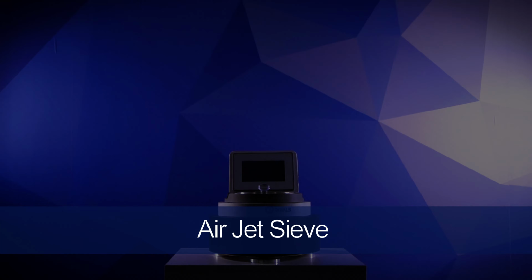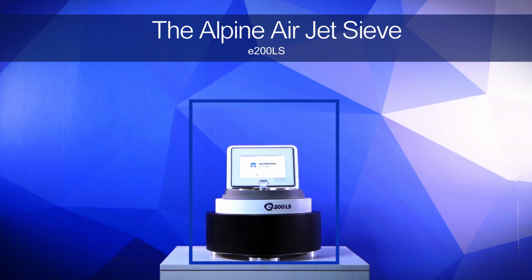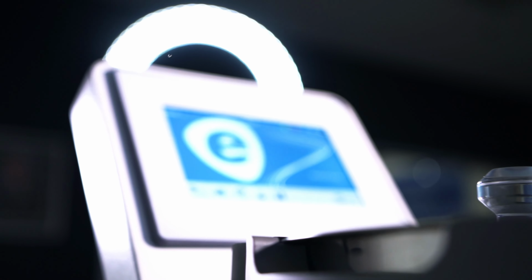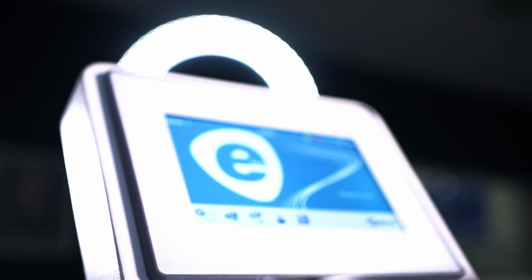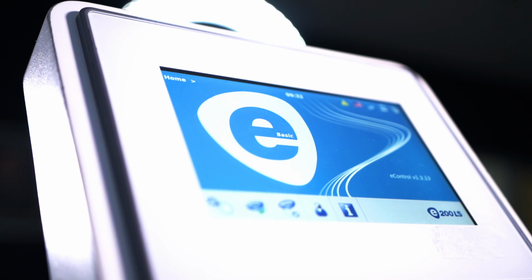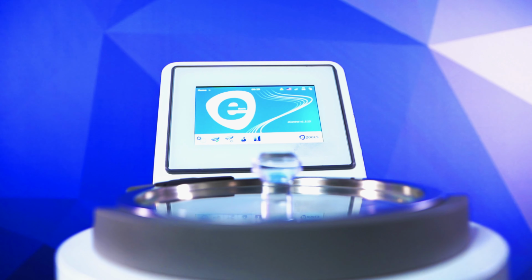Jet Sieves, like the Alpine Jet Sieve E200LS, is another particle analysis tool that has been gaining traction in the aggregate industry, specifically during the production of cement mixtures. In fact, the Alpine unit has been written into several cement-related standards in recent years. This is because of its ability to analyze the finer particles that are used throughout cement mixtures that are hard to sieve using a sieve shaker.